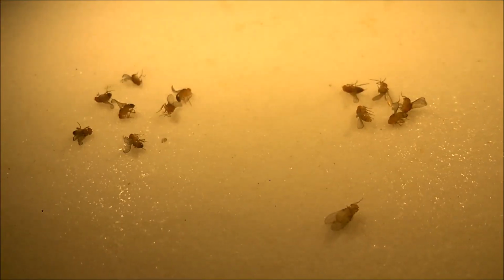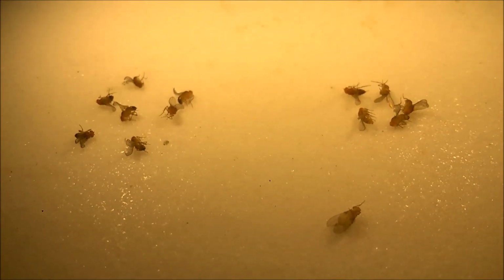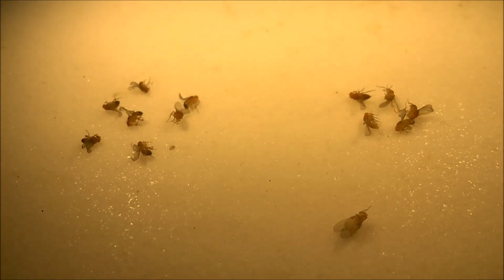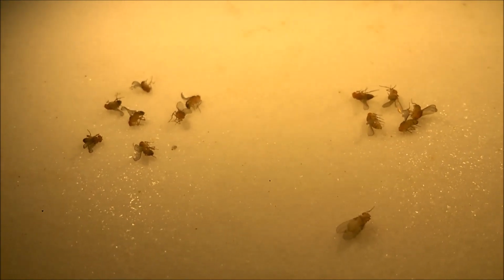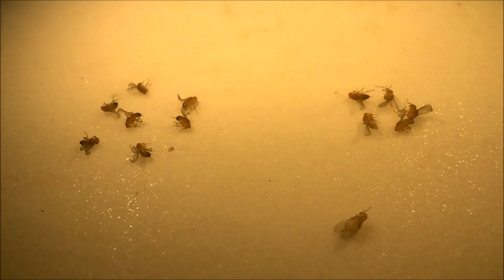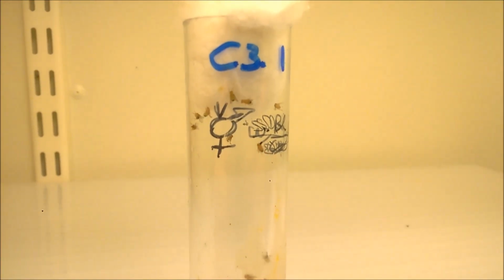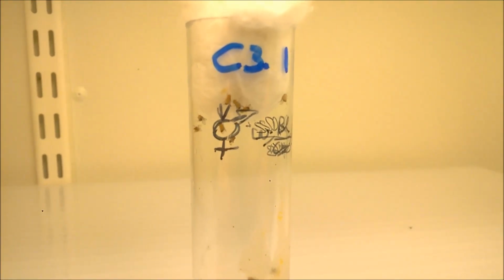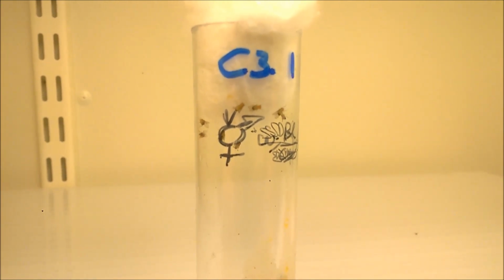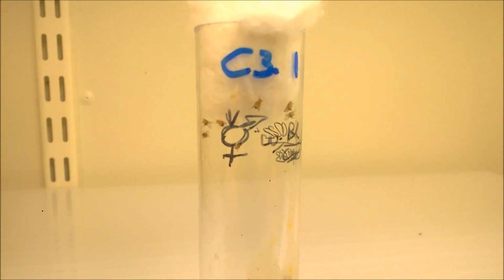It is important to distinguish males from females. On the left you find males, on the right you find females. And also to distinguish females that are virgin from those that are not. Down on the right you find a virgin female. After selection, insects are crossed by simply combining males and virgin females into the same vial for a couple of days.